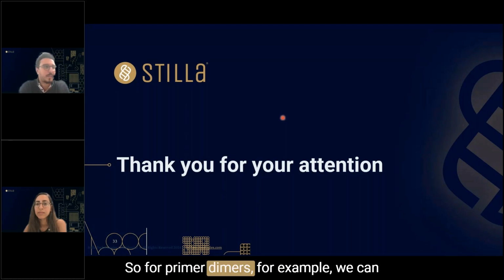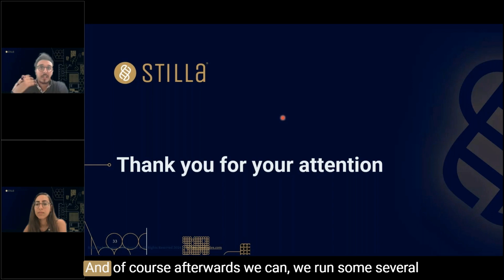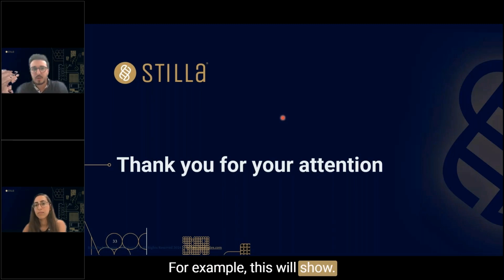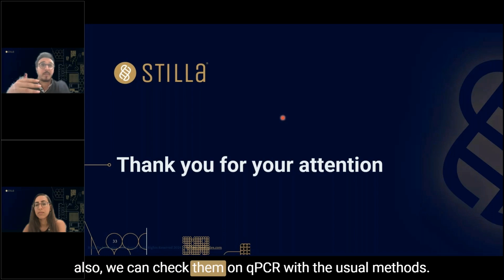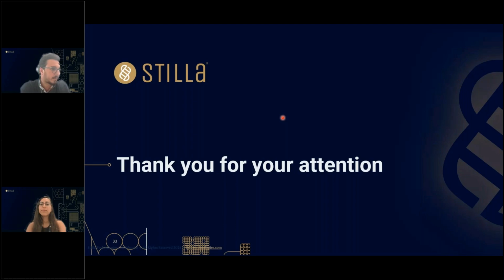So for primer dimers, for example, we can first check them with in silico design, and of course afterwards we run several specificity experiments to see if we have extra populations. For example, this will show if the primers are specific or not. If we have dimers, we can also check them on qPCR with the usual methods. So we again follow the same rules as described for the basic assays.